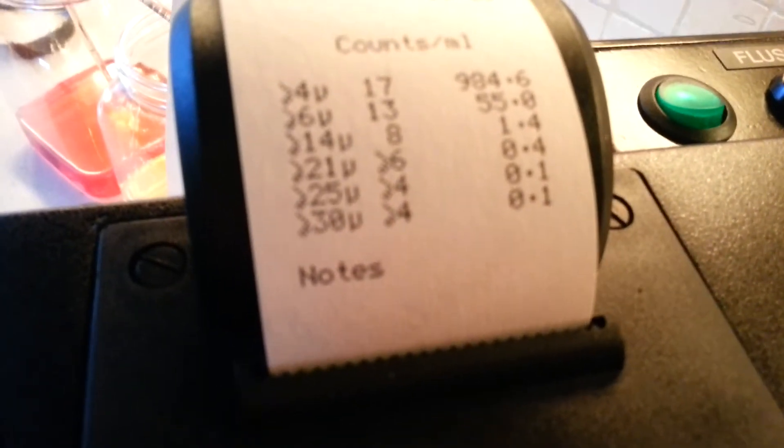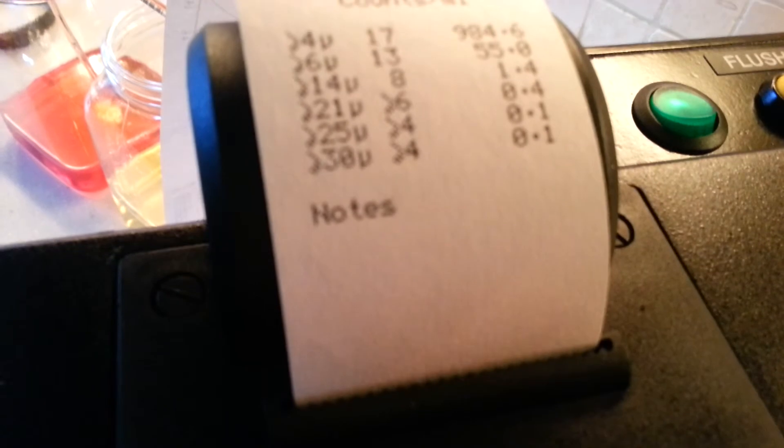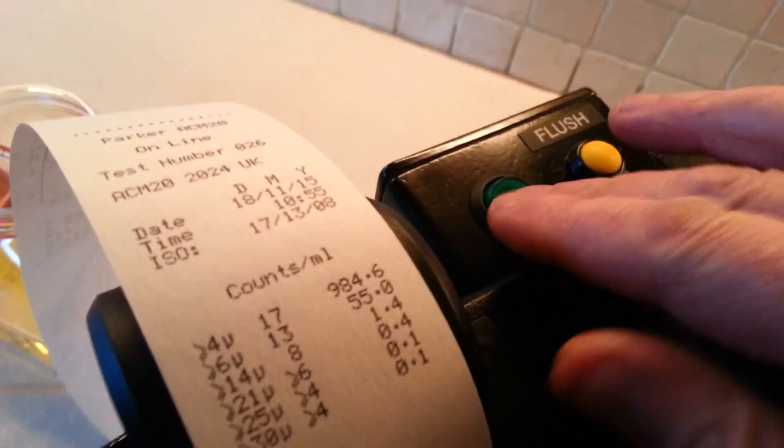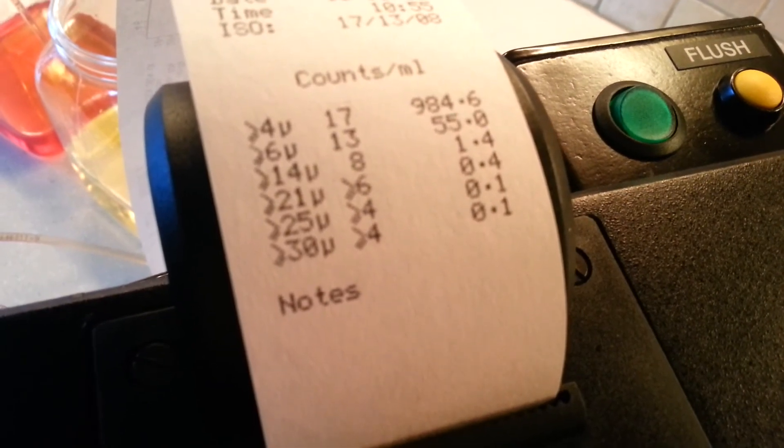More information on the actual unit itself will follow. There's no guesswork involved. We do online sampling all the time, which we can now turn off. The print says it all to the client — no guesswork here.